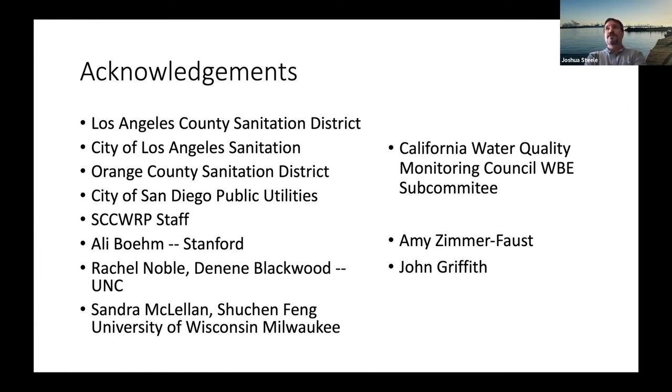With the digital PCR we use, some folks have been trying to spin out the solids and just look at the influent in the water itself. We don't. We look at the whole suspended solids and the water, and I think that digital PCR helps us. We think it works in two ways. One way is that digital PCR, by encapsulating the reaction in a very small volume, can exclude some inhibitors that way.